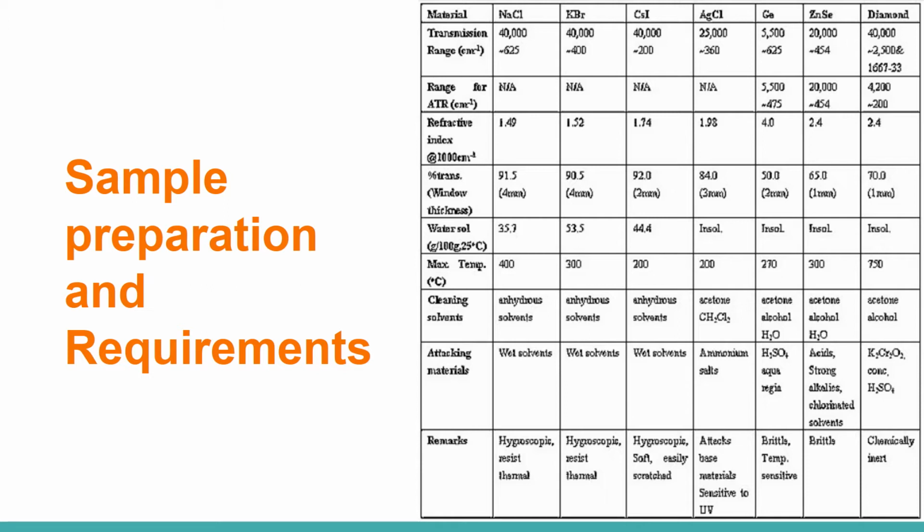So after walking around ASU and the Goldwater undergrounds and getting lost for a couple hours, you come across a pretty cool room. It has an FTIR. You kind of remember what it does, but there's no one around. But you think it'd be best to use it now, so that way if you do screw up, you can just walk out. No one will notice. It's a pretty good plan. Probably won't get caught. So continue.